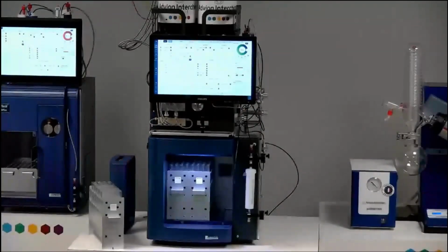This question says, what is the sampler setup? How many samples can be added? And what is the range of the loading volume?